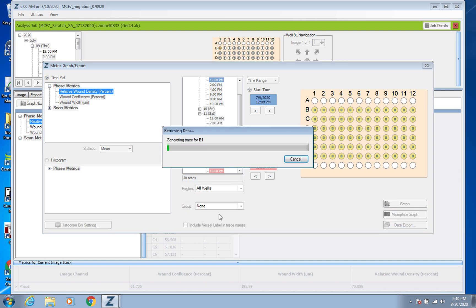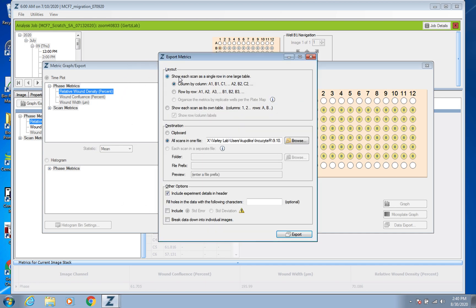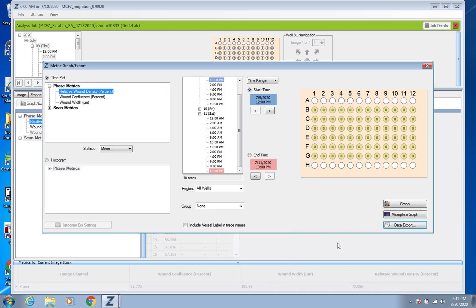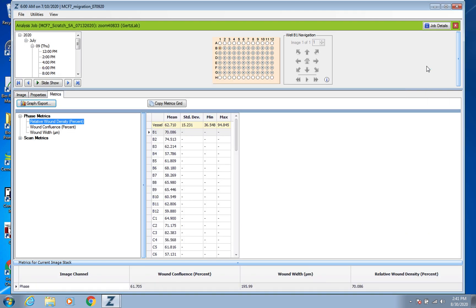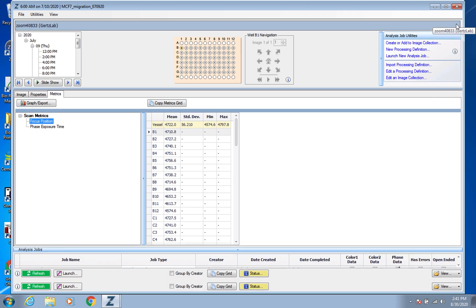And then again you can get that Microplate Graph. But you go to the Data Export, you can do it by rows or columns as I mentioned before, and put it on your flash drive or whatever as needed and then press Export down here.